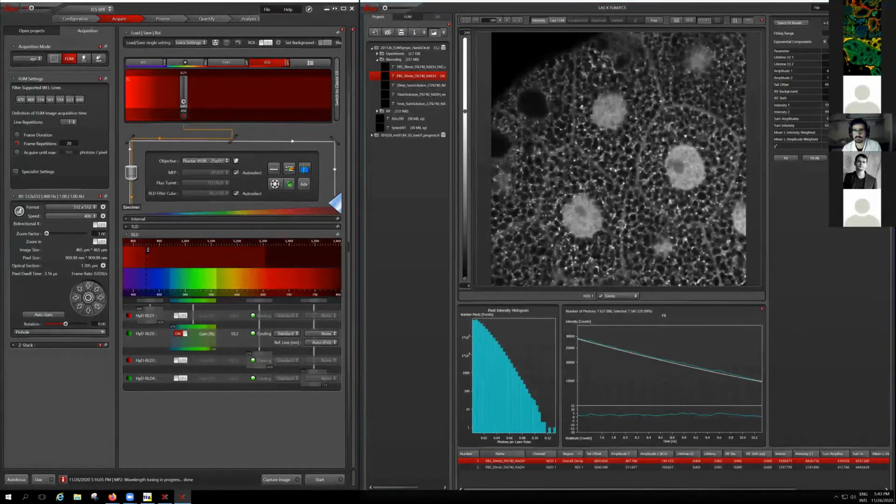That seems in contradiction with many pieces of advice regarding the chi-square. But what is important is that in some of the software, what is shown here is a reduced chi-square. That's a different definition than the chi-square itself. So what I have learned and been told regarding the chi-square in this software is that a value of about 5, 6, even up to 8 is actually okay.